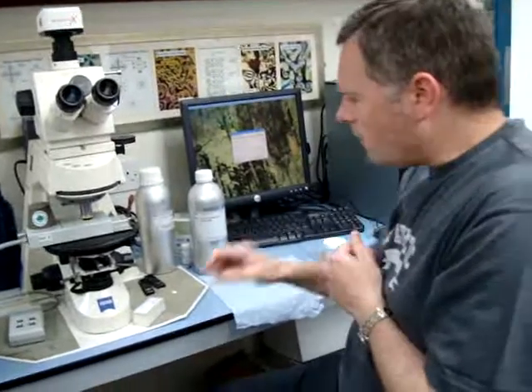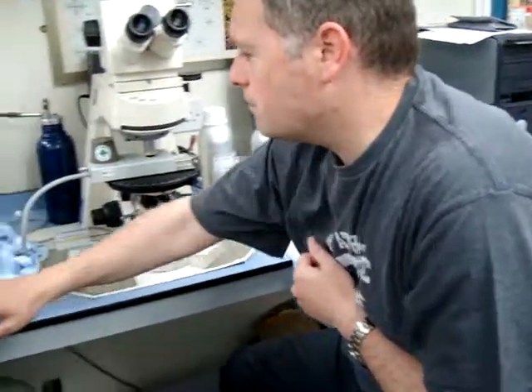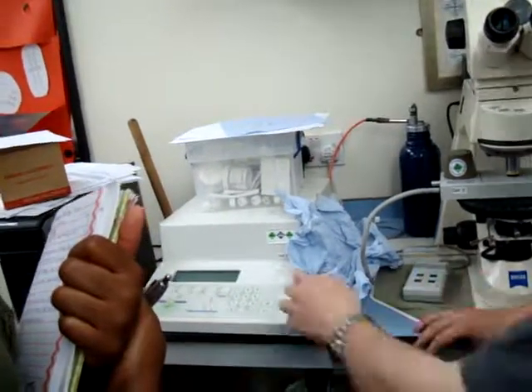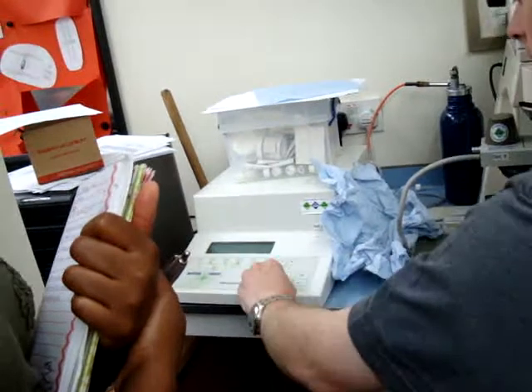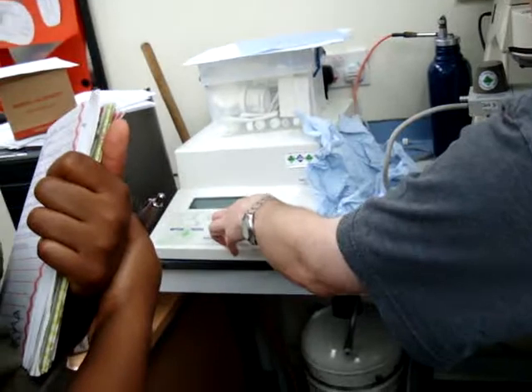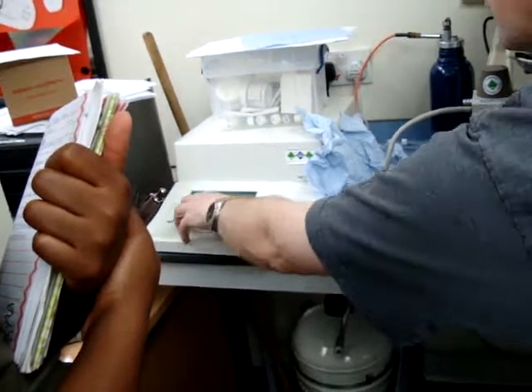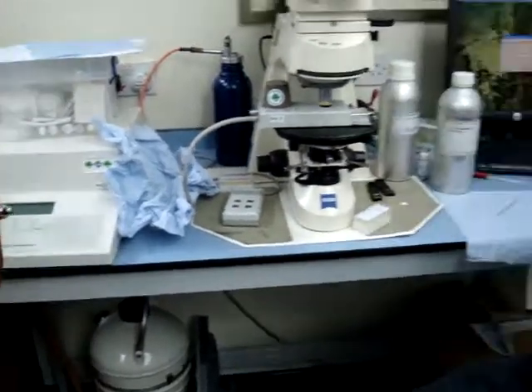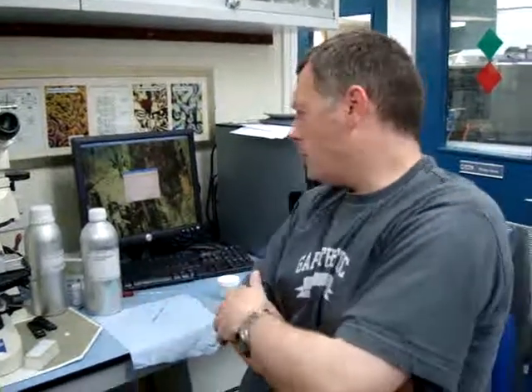Now, as I say, let's just heat that up. So, general rules of thumb are, if you're heating up your sample, and it's a sample you don't know, then you're going to heat up fairly slowly. So you're going to go at a nice controlled rate. And I would say never go anything more than about 5 degrees a minute.